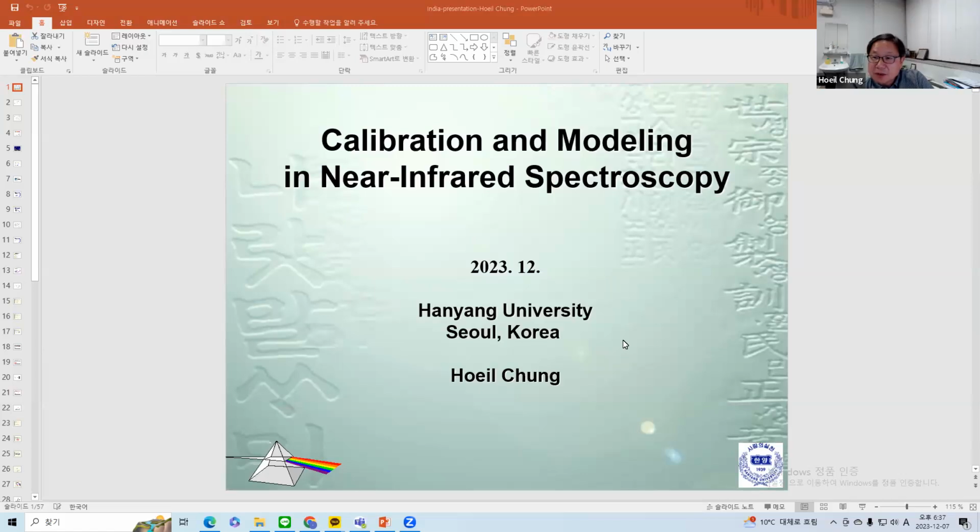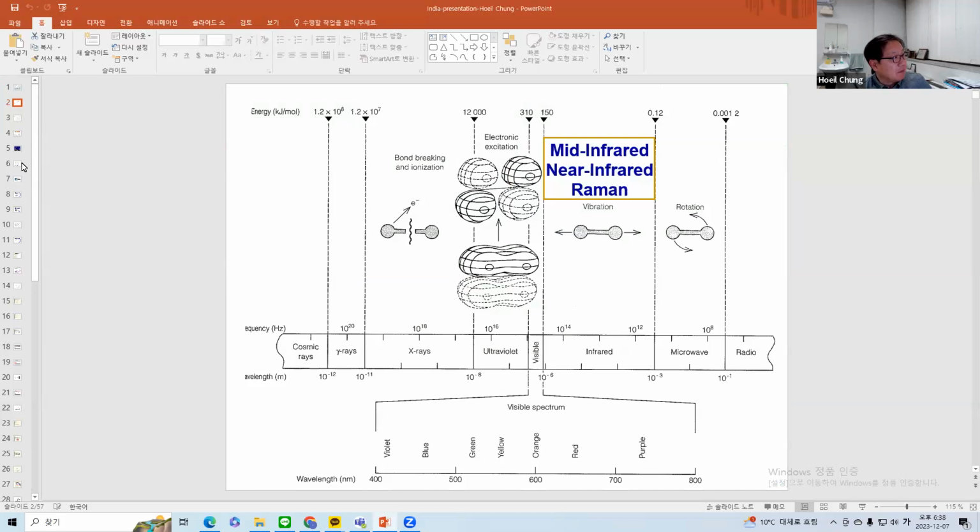Okay, thank you for the introduction. And my presentation is supposed to be 45 minutes, right? Yes. Okay. So let me start with my presentation. Actually, today I'm going to talk about what is important in the calibration using NIR spectroscopy. Okay, and in this slide I will skip this one.